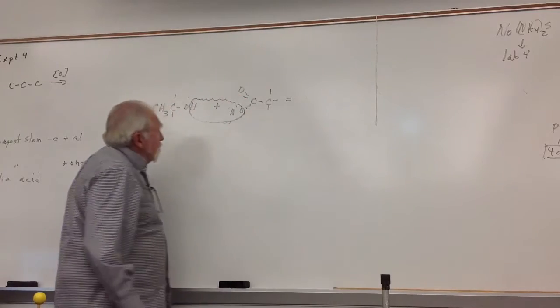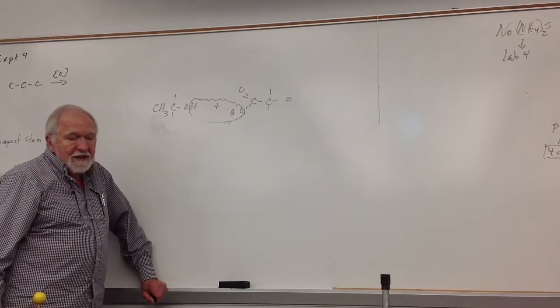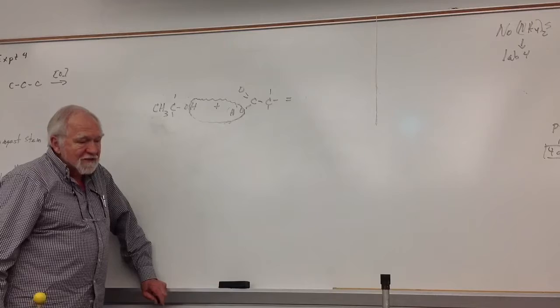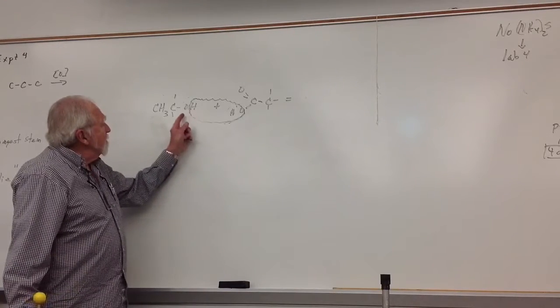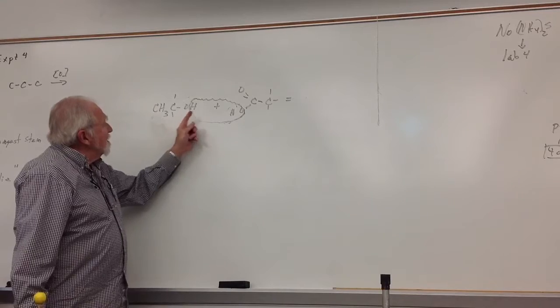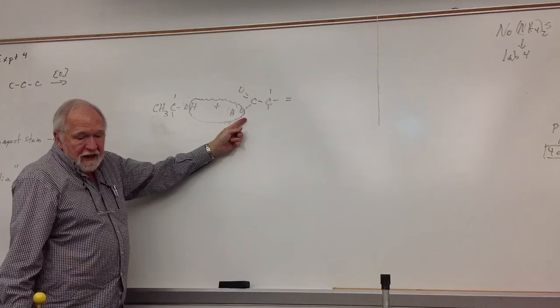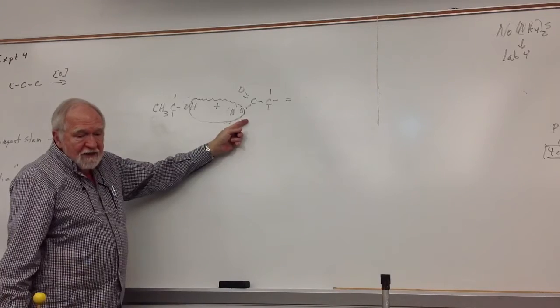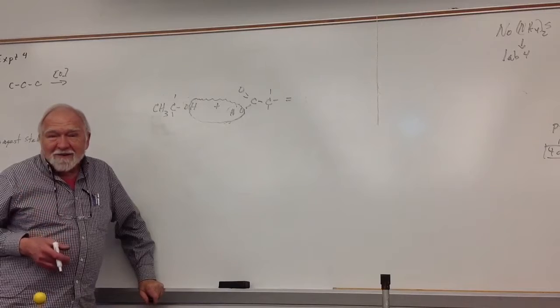And when you do esterification reactions, and this is, by the way, when we do the test for acetates, if we do the anions, which I don't think we will, if you do the test for acetates, it involves taking alcohol, combining it with acetic acid or converting your acetate to acetic acid by using sulfuric acid, and then smelling it to see if it smells like banana oil.